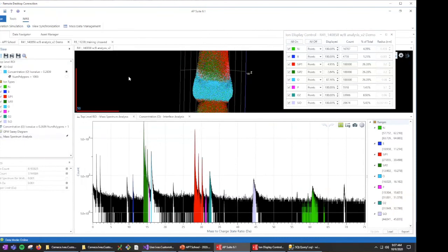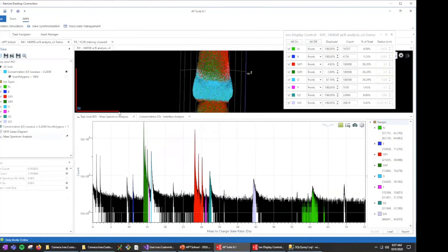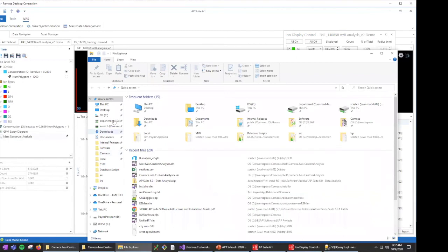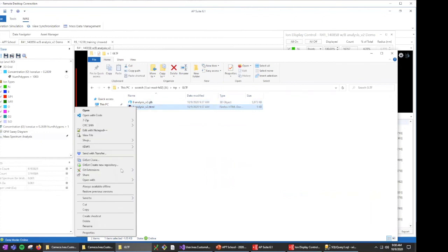And if I save this, that went pretty fast, and I open up the file. So this is on our network drive, and there's two files here. One is a web page that I can open. Let's say, open this with Chrome.